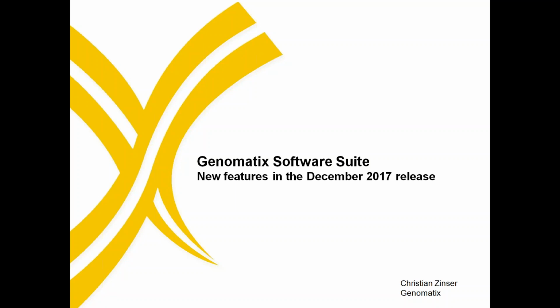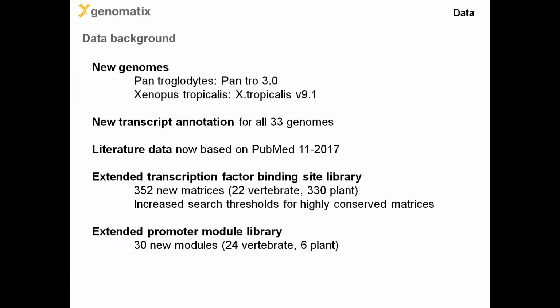So, good evening from Munich. My name is Christian Zinser, and I will show you an overview of the new features in the December 2017 release of the Genomatix software suite. First, a few introductory slides, and then a live demonstration of some of the features.